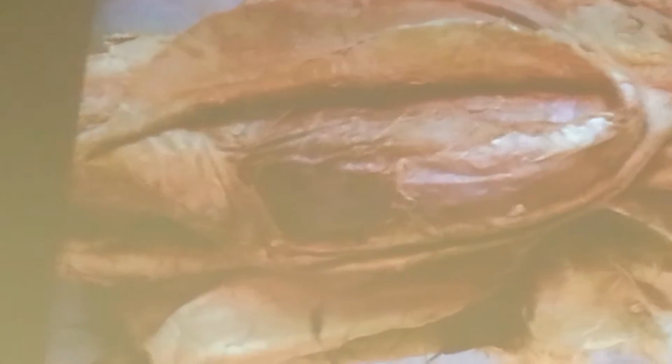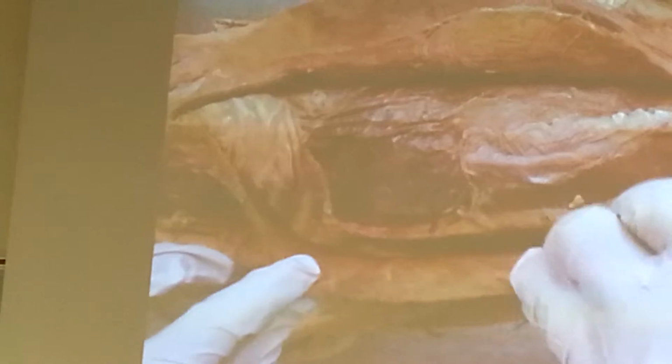Okay. Now when you put both of them away, you need to see two other muscles. You see this one? This is internal oblique muscle. It is all the way to here. This was external oblique, and this is internal oblique. Just bring it here to the middle so that you can see them better. You see this border of that? This one? This muscle is internal oblique muscle.